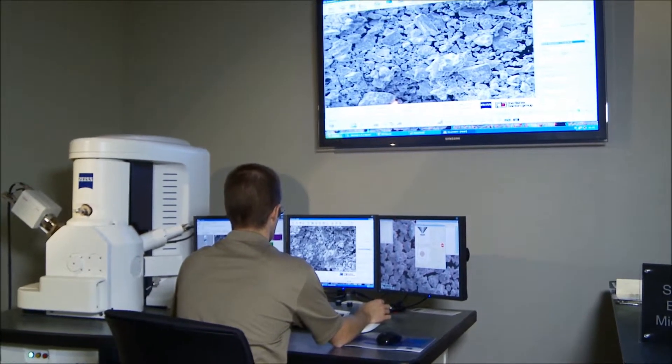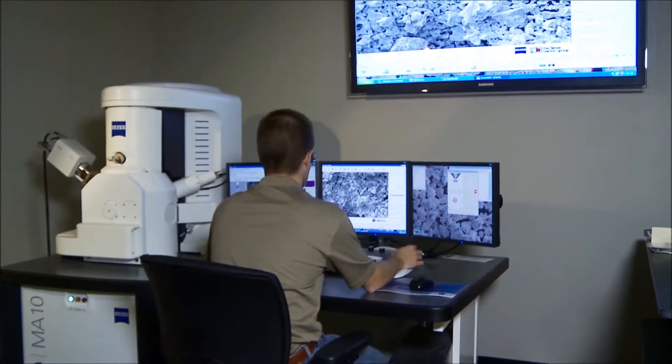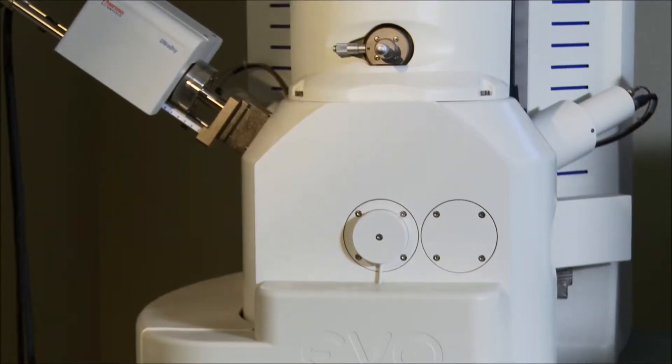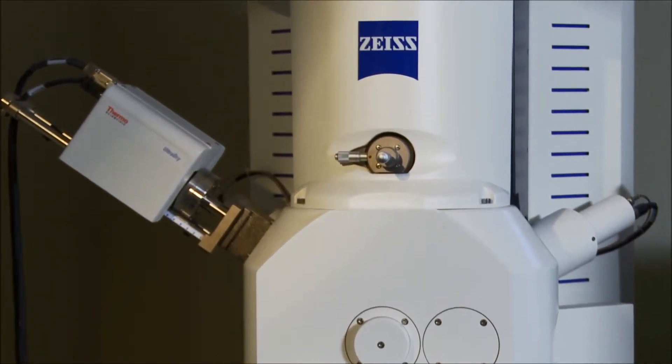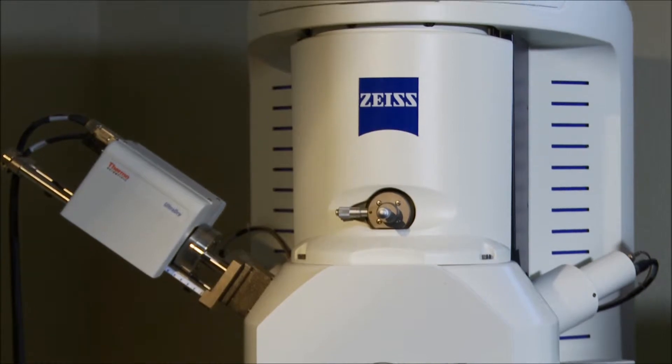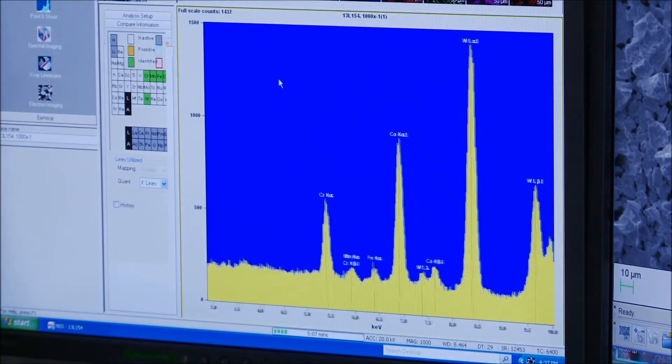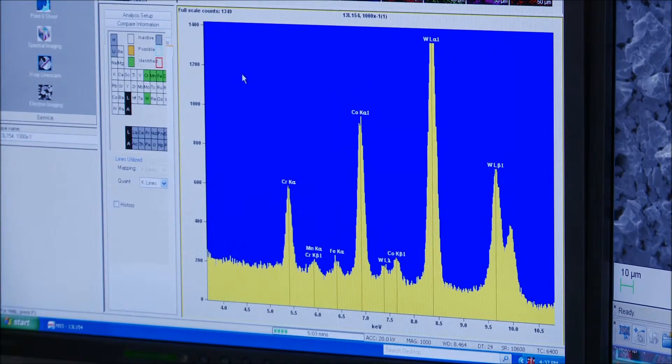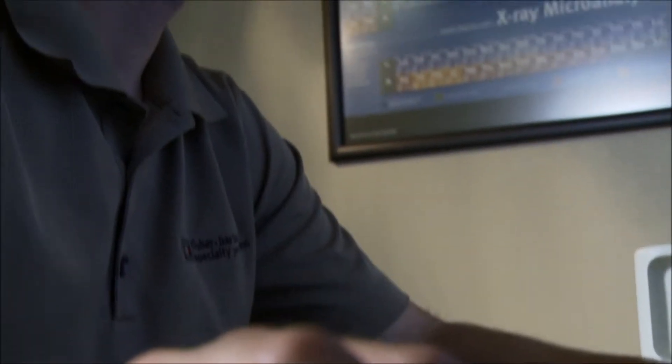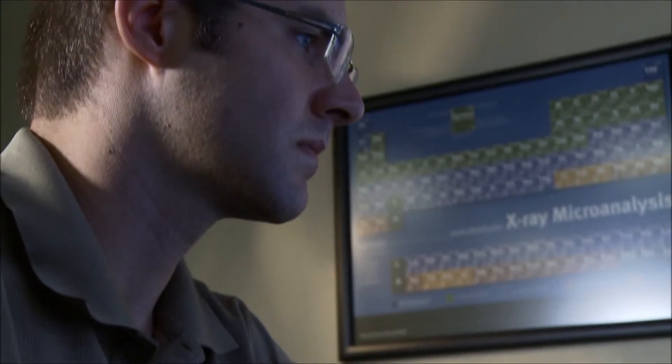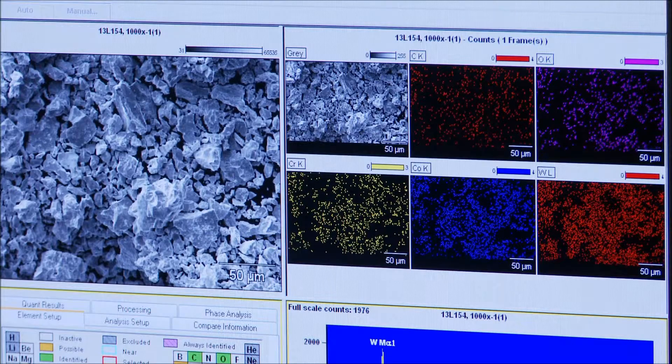One of the highlights of our microscopy lab is our Zeiss MA10 scanning electron microscope, also known as a SEM. And what this is capable of doing, this allows us to look at things that we can't see with the naked eye or with a standard white light microscope. This allows us to go up to magnifications as high as 100,000X in order to look at a fracture surface or look at a component and really observe what the microscopic features or characteristics are within that material.